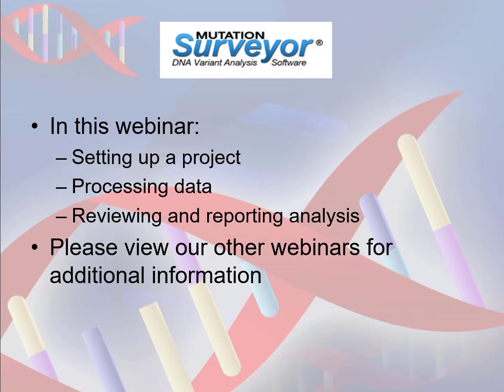The key points of the workflow we are about to cover include creating a project by loading files and setting the project parameters, processing the data, and then using the different functions included in the program to review your results and generate reports.